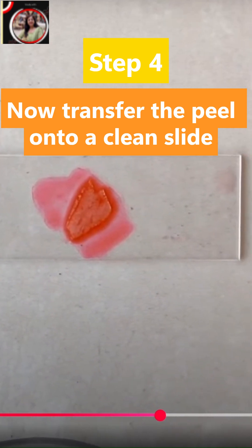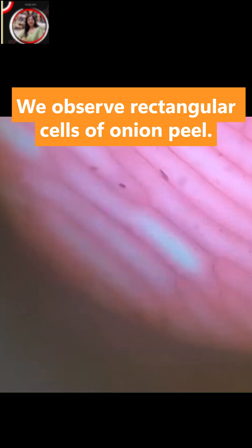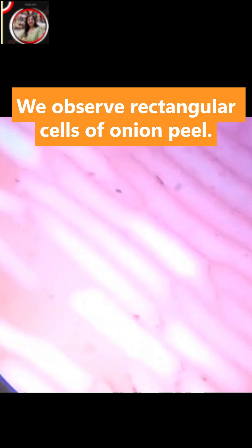Gently put the cover slip, avoiding entry of air bubbles. And now observe the slide under the microscope. We will observe rectangular cells of onion peel.